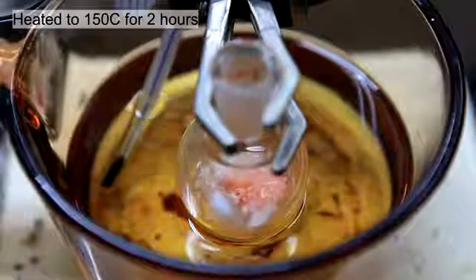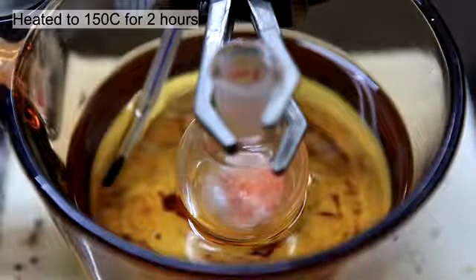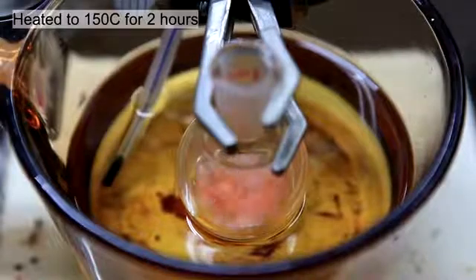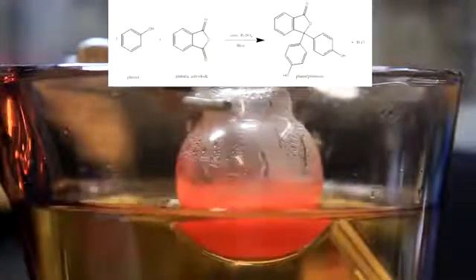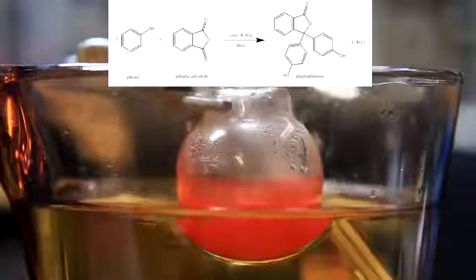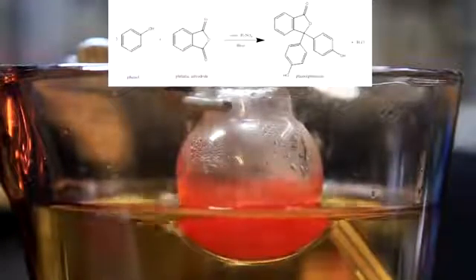As the heat increases, the phenol should melt and the mixture should liquefy. At this point you can already see the red colour of phenolphthalein forming. The reaction occurring is shown above. Two molecules of phenol react with one molecule of phthalic anhydride to form the phenolphthalein molecule and water.